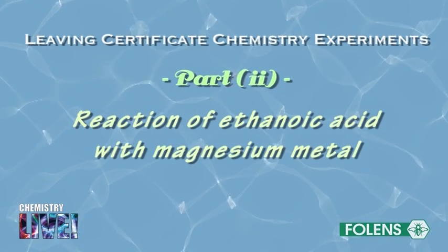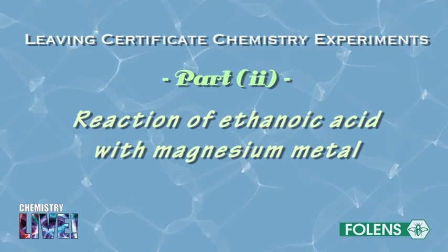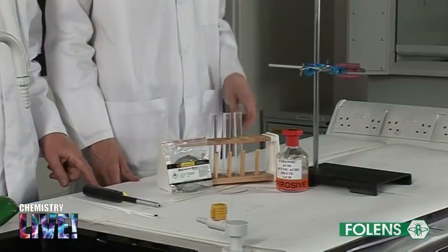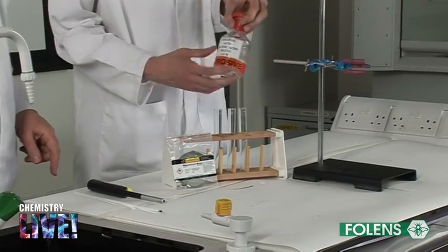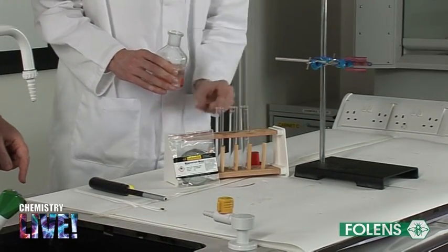We now investigate the reaction of ethanoic acid with magnesium metal. A test tube is filled to about one quarter of its capacity with dilute ethanoic acid.